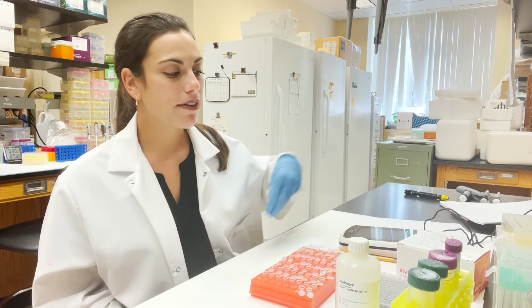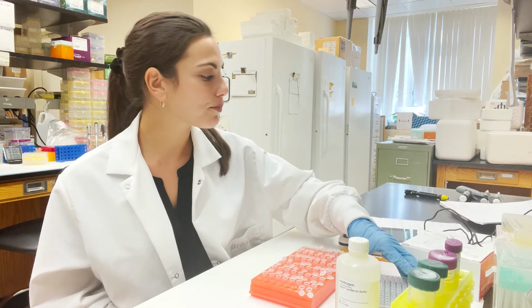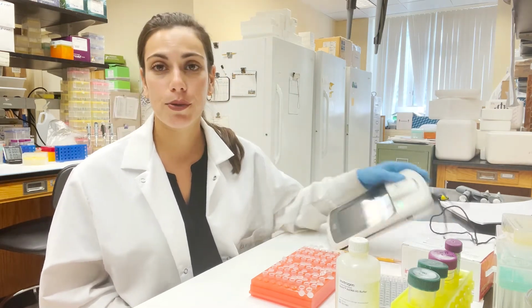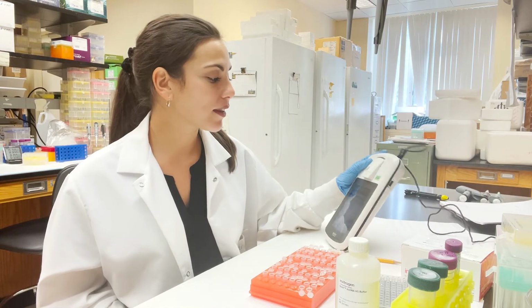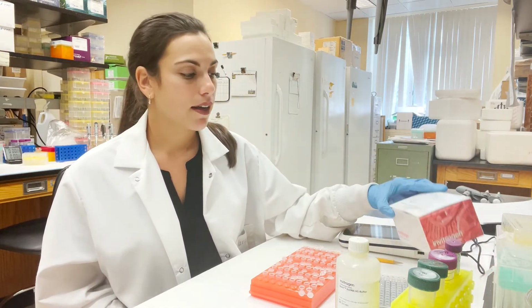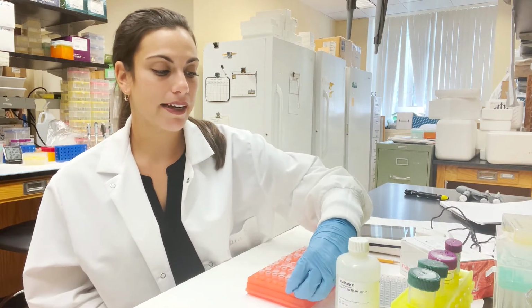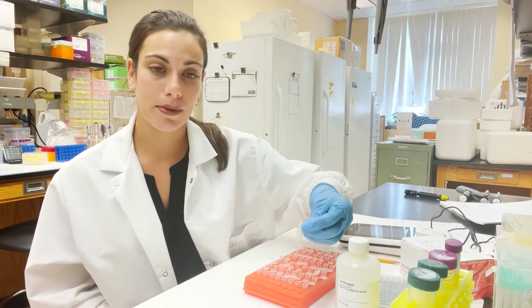Now we have to determine if our pipeline worked. And the way that we do that is we evaluate each of our PCR products' concentration on the Qubit fluorometer. What this does is it uses a double-stranded DNA reagent in each of the samples and compares it against that within the standards to calibrate the instrument.